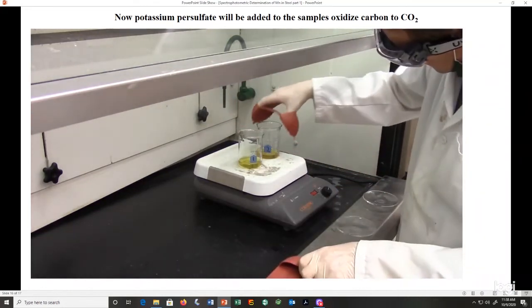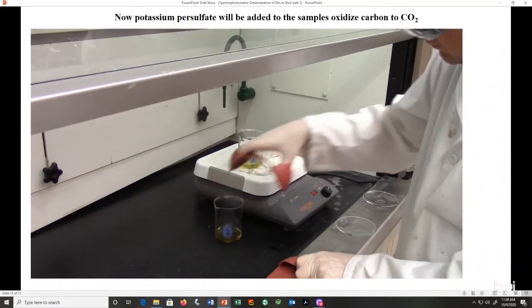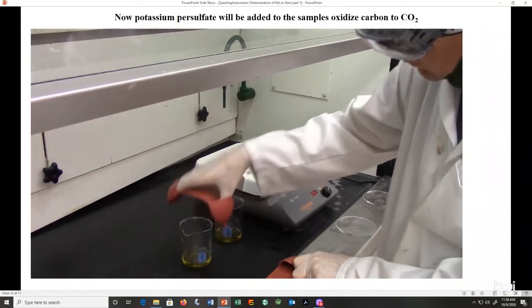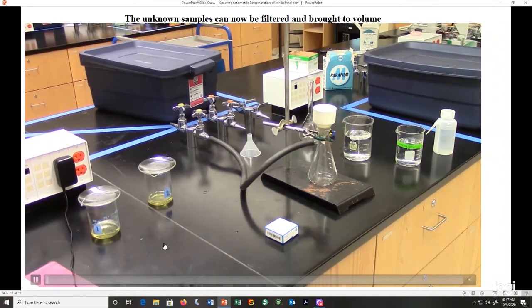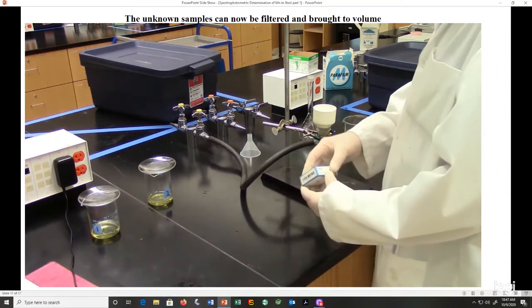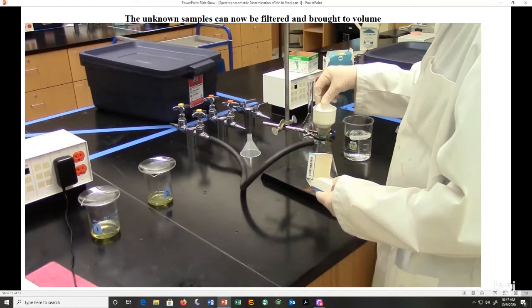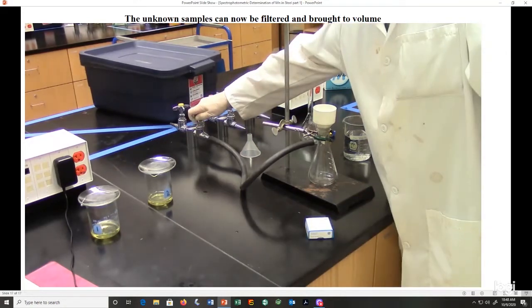So at this point, once our samples cool down, they can now be filtered and brought to volume. The unknown samples can now be filtered and brought to volume. So we're going to use a number 41 filter paper to filter our samples and a Buchner funnel.